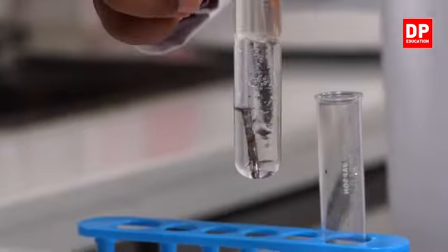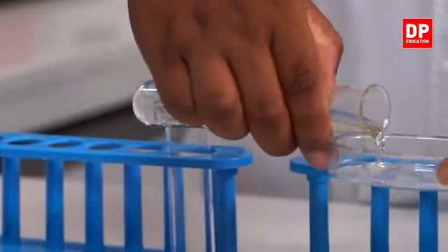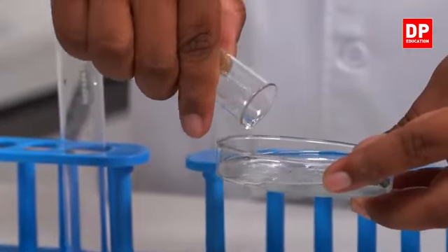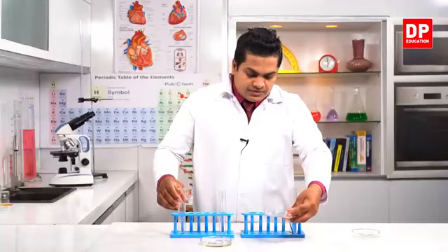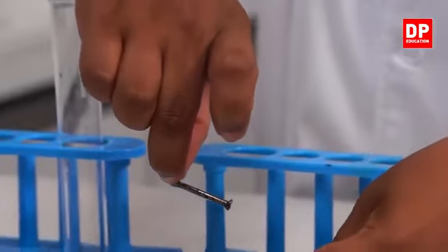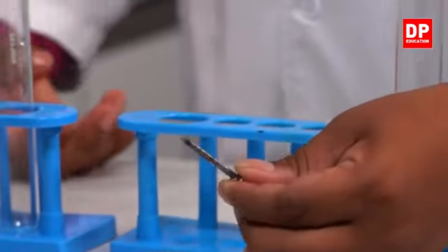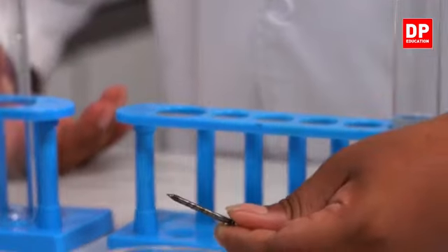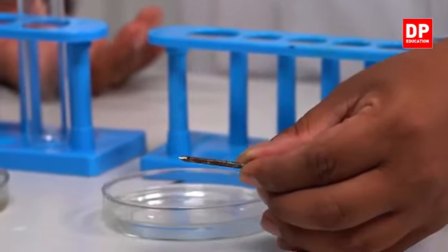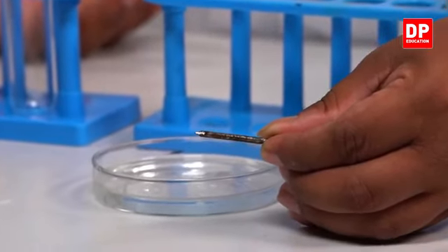So I'm going to pour it into this Petri dish once again to observe the color change. So in this one you can observe there is rust, but only up to a certain extent.